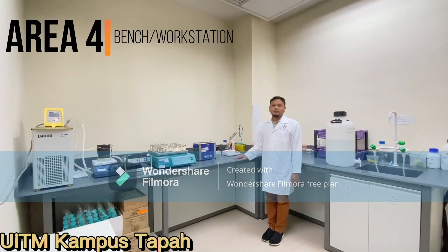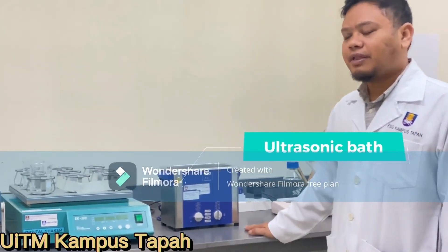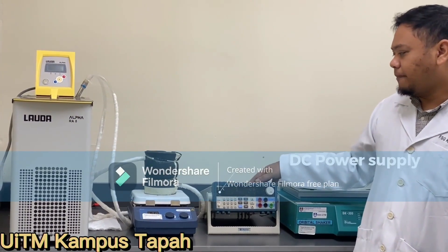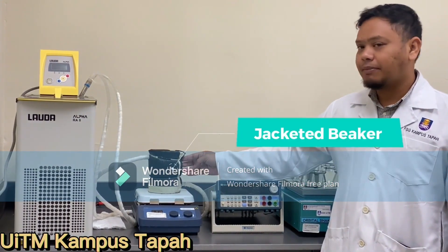This is another workstation for us. Here we have a mini dry bar, a pH meter, a thermostatic water bath, and also our orbital shaker. This is our alumina fabrication station. We have here our power supply, our magnetic stirrer, and also our fabrication chamber for alumina.